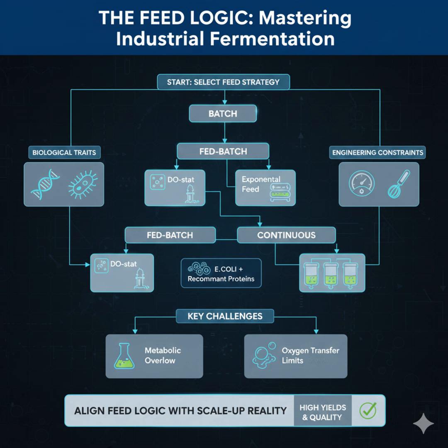So what are some examples? Well, there's the mu-stat, which uses real-time biomass measurements to calculate and maintain a specific optimized growth rate. Or Model Predictive Control, MPC, which can simultaneously constrain multiple variables, like heat generation and QS, and predict the optimal feed strategy hours into the future. But the complexity is huge. The complexity, the maintenance, the validation required, it all means you have to have a strong digital infrastructure and a highly specialized team to make it work.